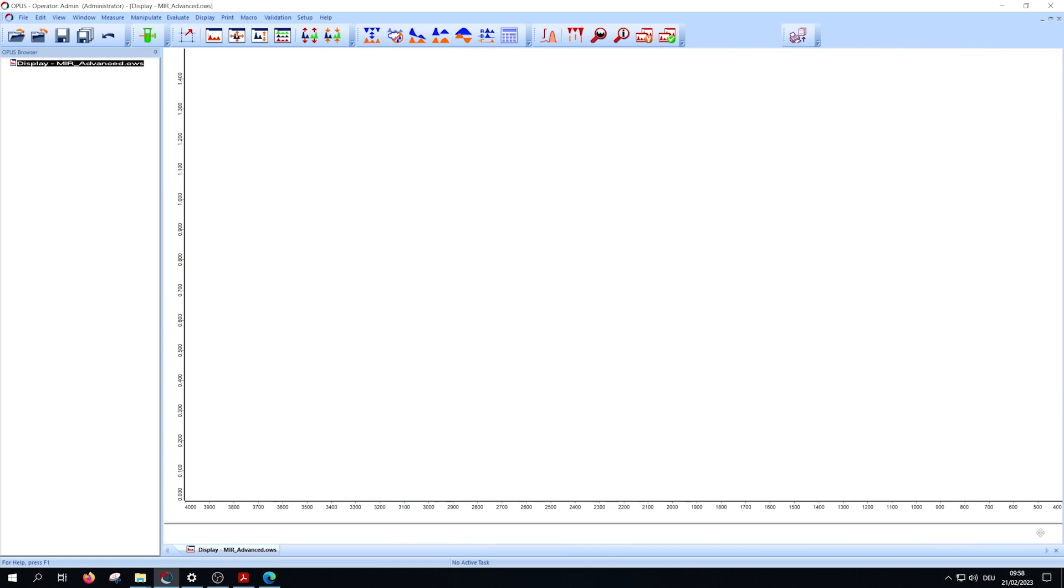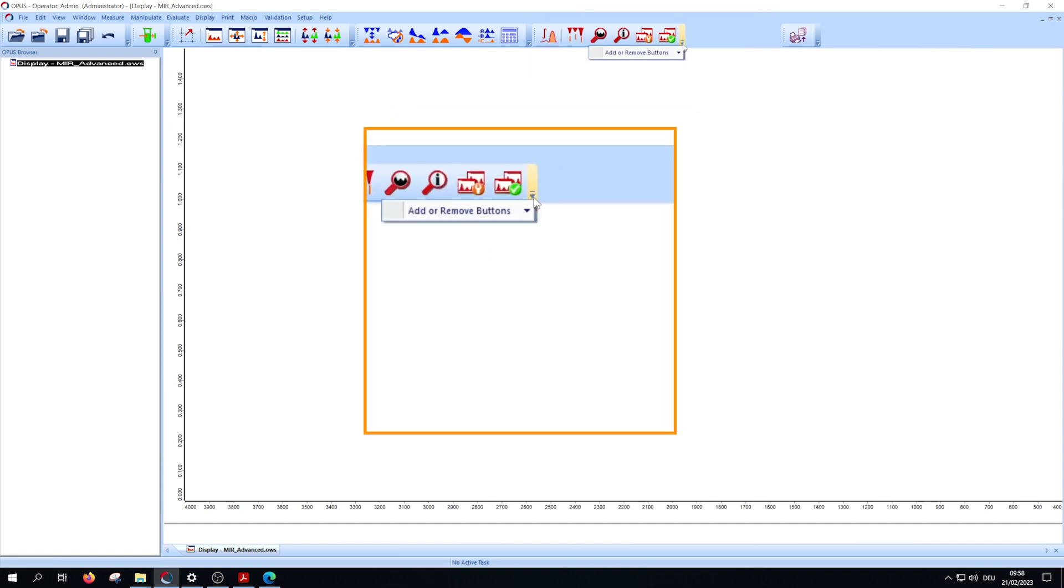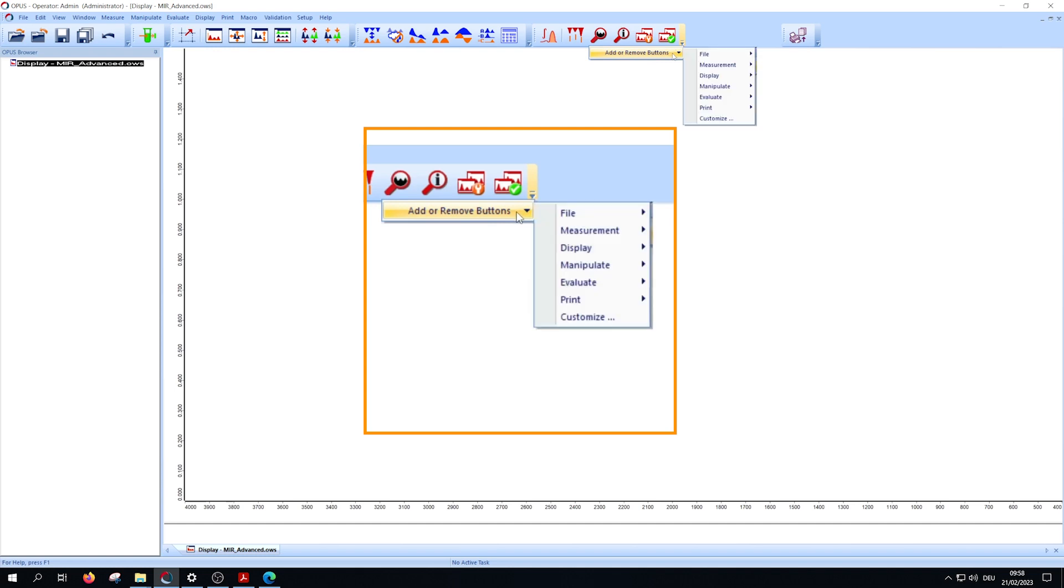To create a multi-evaluation method, short MEV, you have to add the relevant menu buttons. Left click at the dropdown menu, hover over add or remove buttons and then click on customize.